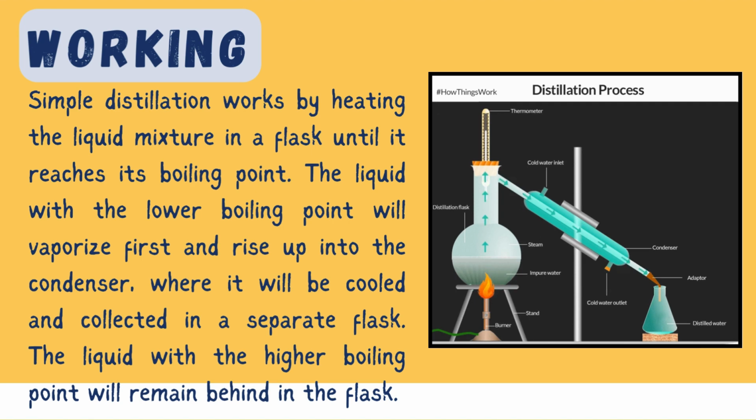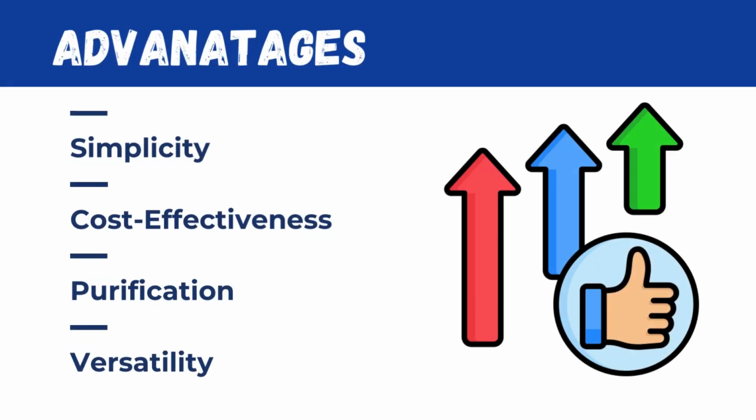Okay? So guys, after the working of simple distillation, we are moving on towards the advantages and disadvantages of simple distillation. First of all, we will be looking at the advantages of simple distillation. The first advantage of simple distillation is simplicity. As the name suggests, it's a straightforward method. The setup and the process are relatively easy to understand and execute.